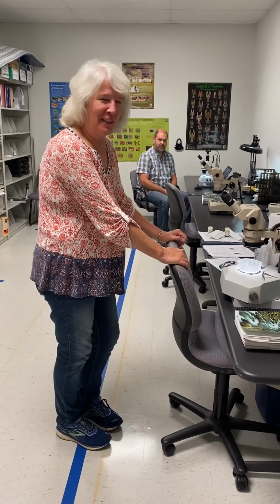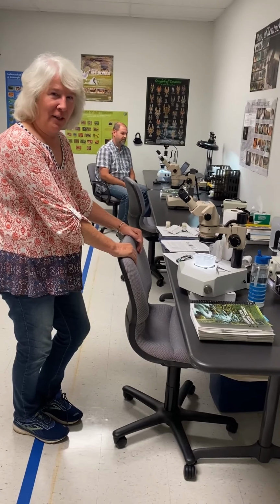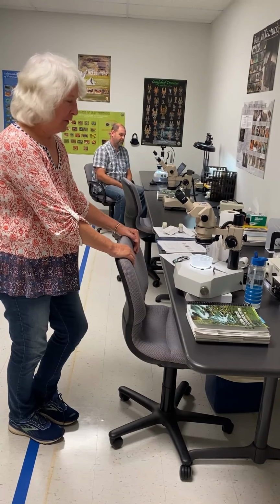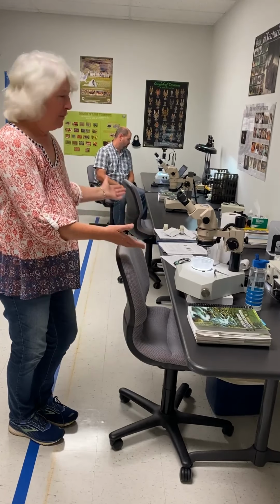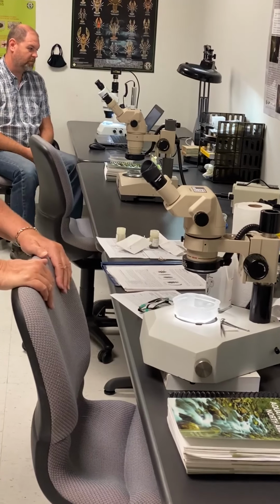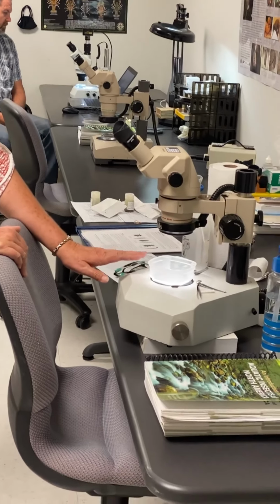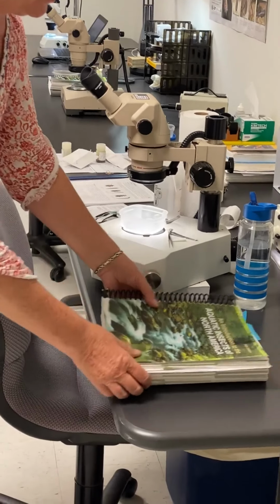Hi, my name's Beverly and this is Franklin. We're back in Johnson City at our lab here in our office. I wanted to show you around, show you how we identify our insects once we collect them in the field. We use our microscopes here. We've got 3 different microscopes that we use. We come in and we put our insects under the microscope, and then we use our various keys to identify our insects.